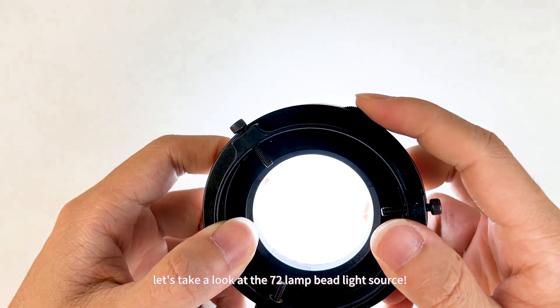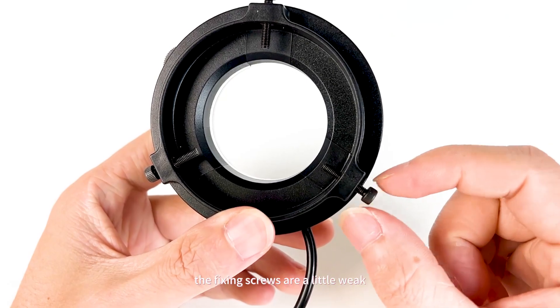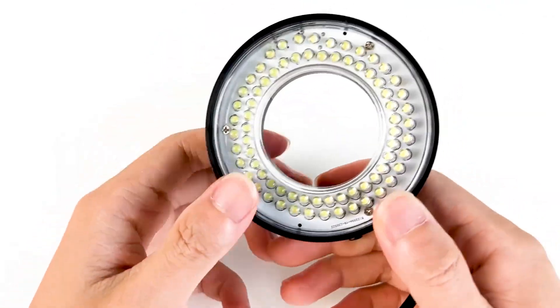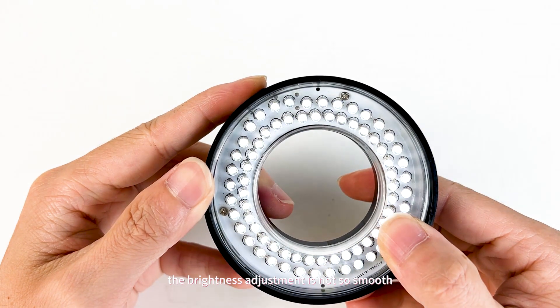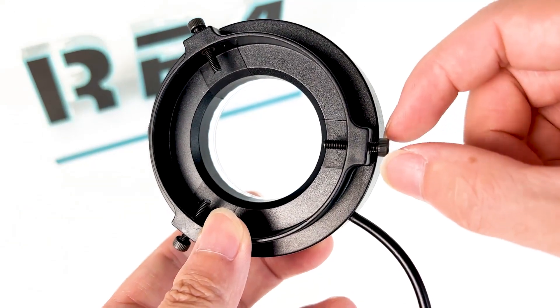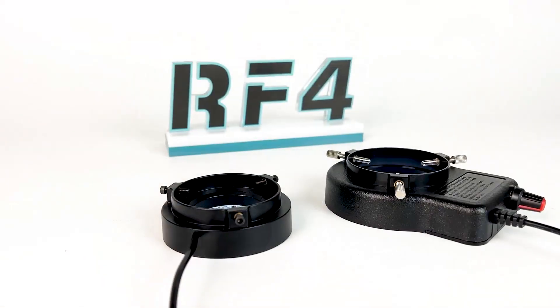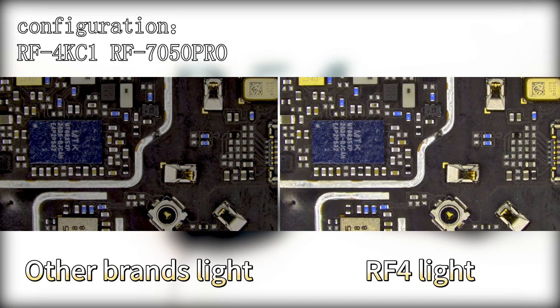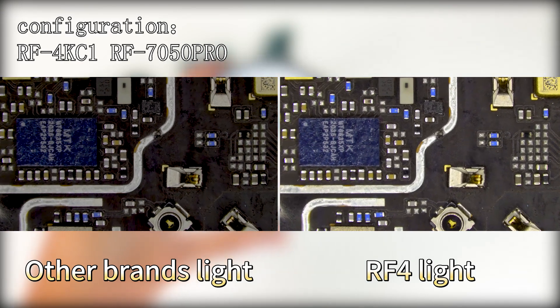Then let's take a look at the 72 lamp bead light source. Although it is light and compact, the number of lamp beads is small, the fixing screws are a little weak and it is a little difficult to tighten. Moreover, the brightness adjustment is not so smooth, and it doesn't feel as comfortable without the RF4 lamp.